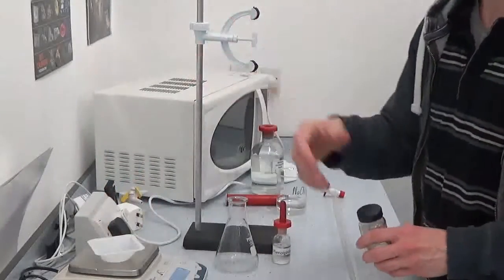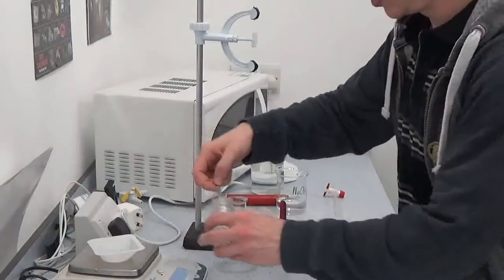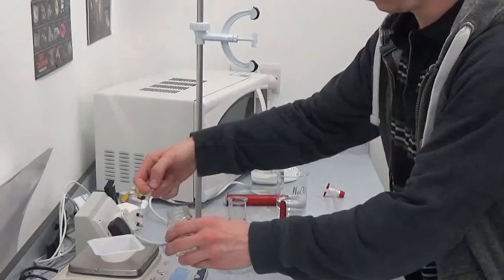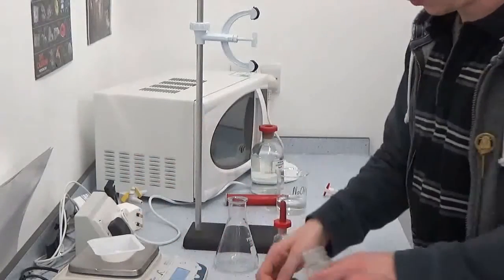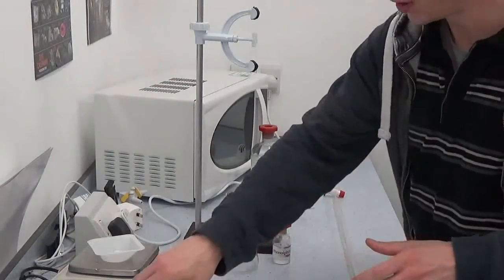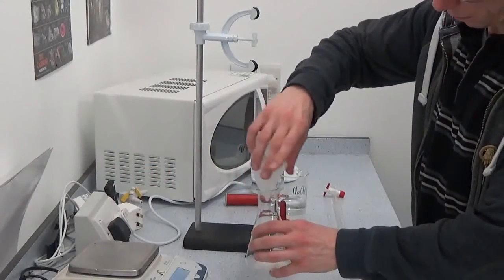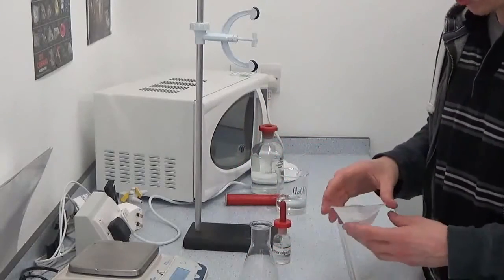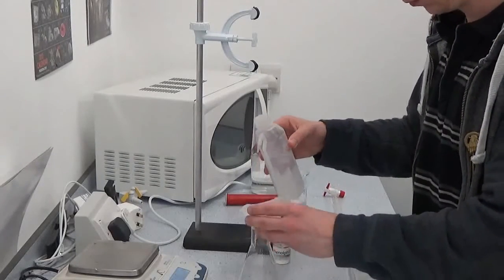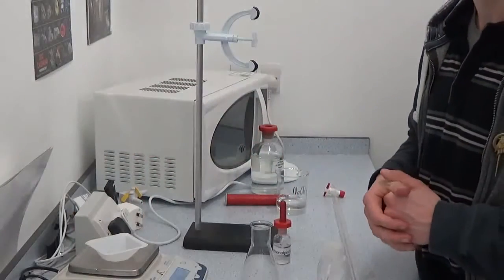To start off, very similar to making up a standard solution, I'm going to weigh out — it's about one and a half grams there. Now that one and a half grams, just tip straight into a conical flask. You can re-weigh the boat just so you know how much of the actual solid you've added.